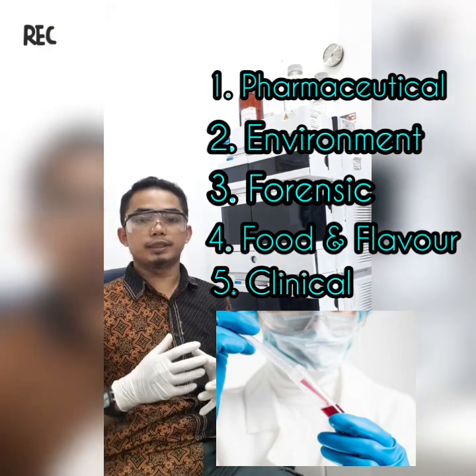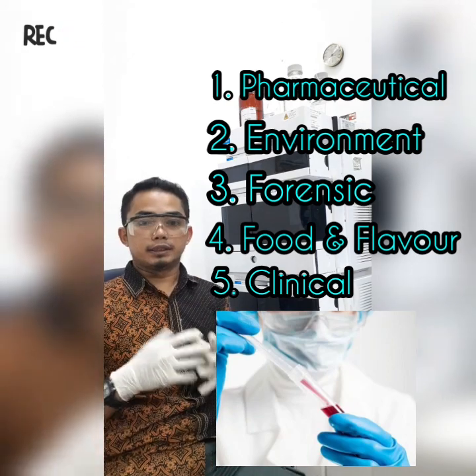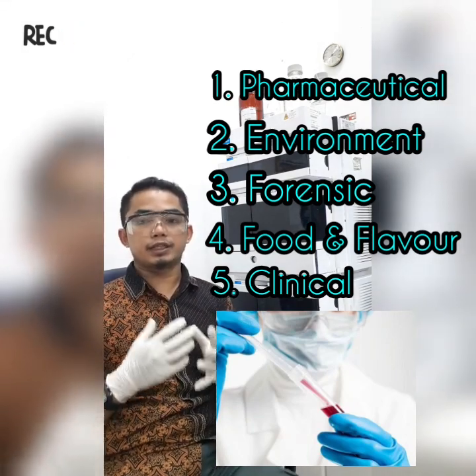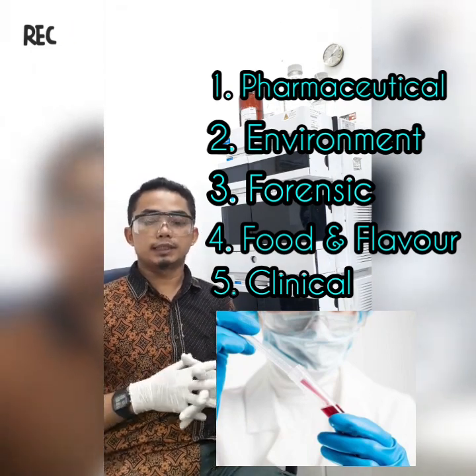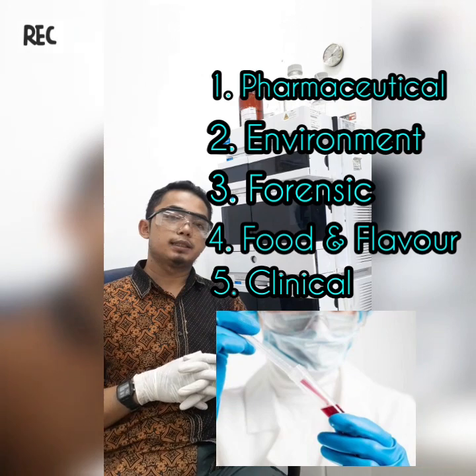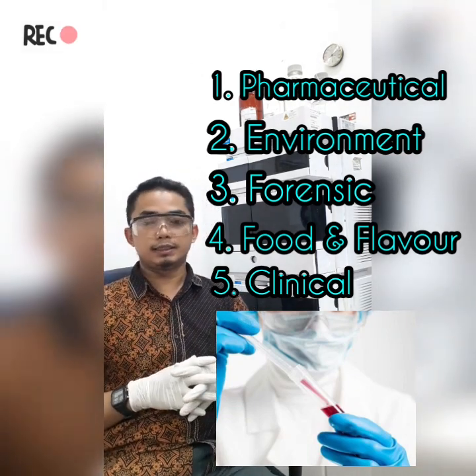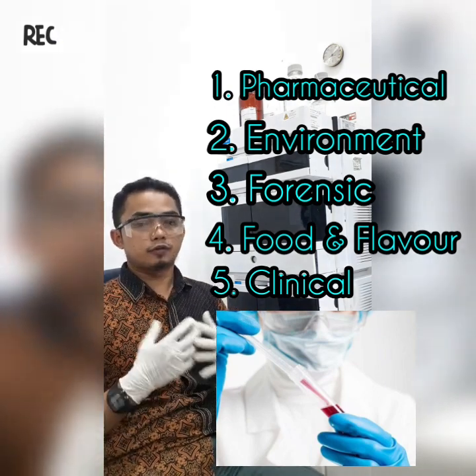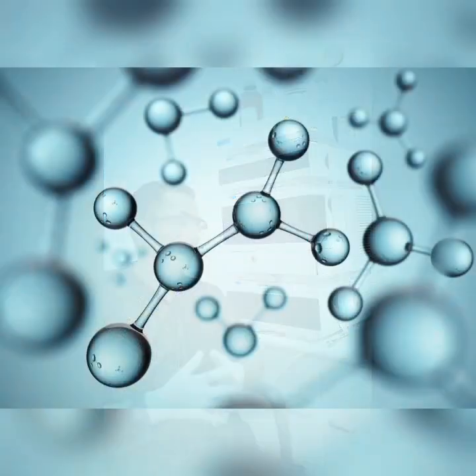Analysis of bilirubin, analysis of biliverdin in hepatic disorder, and detection of endogenous neuropeptides in extracellular fluid of brain, etc. Okay, this is other application of HPLC: industry, pharmaceutical, environmental, forensic, food and flavor, and clinical tests. Okay.